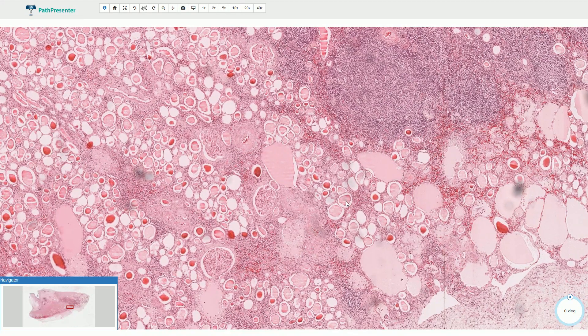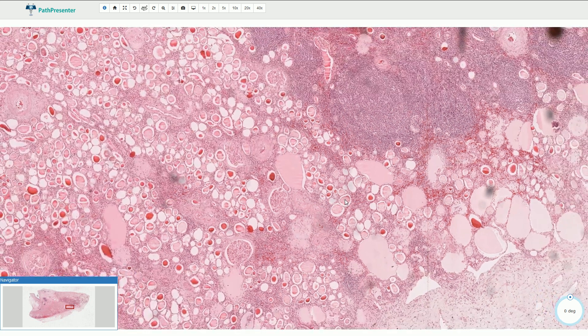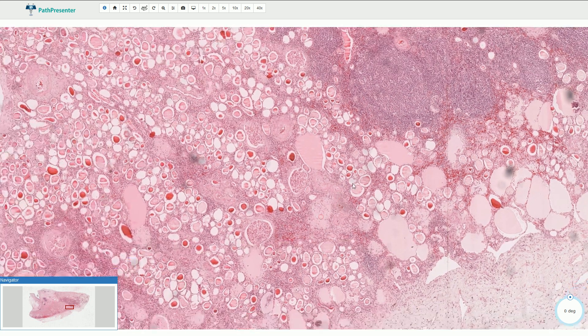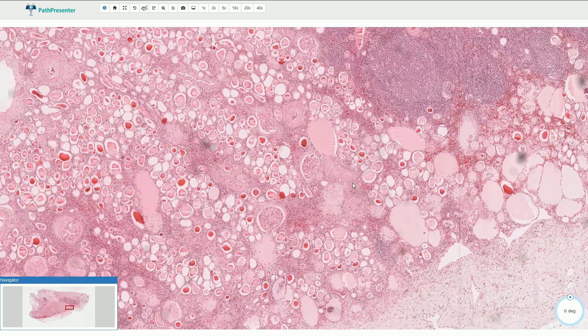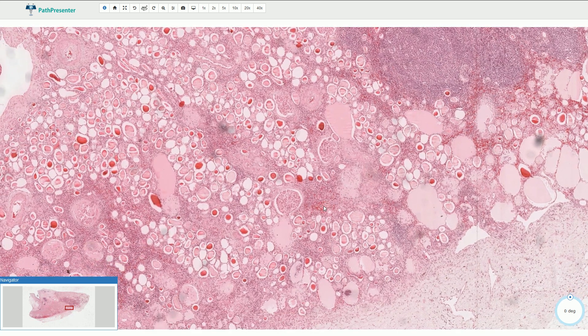This thyroidization is more commonly associated with reflux nephropathy, and urinary tract obstruction is more commonly associated with scarring of the renal parenchyma, but sometimes we can see both of them.